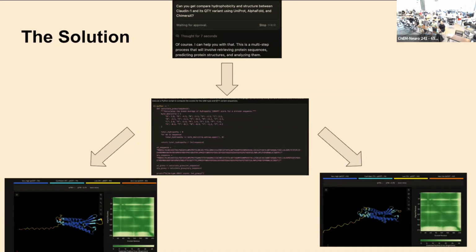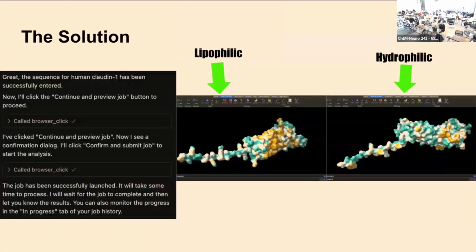And you can see on the right, it is accurate. The one on the right is not an actual protein. It's a theoretical variant of the protein, which is water soluble. And now that we know that they're both structurally okay, we can move on to the next step, which will show proof that it is hydrophilic and that it's water soluble. Water solubility is important for protein research, of course.